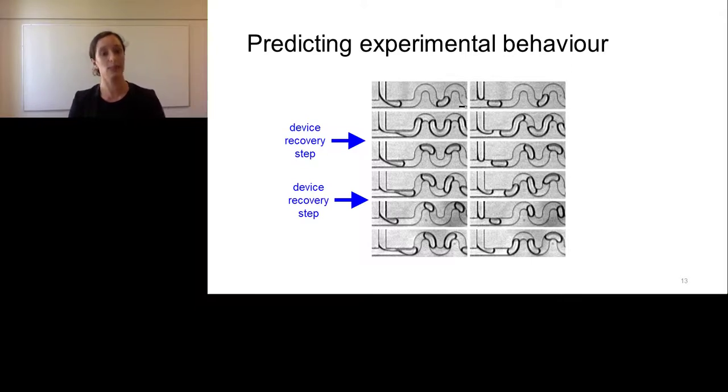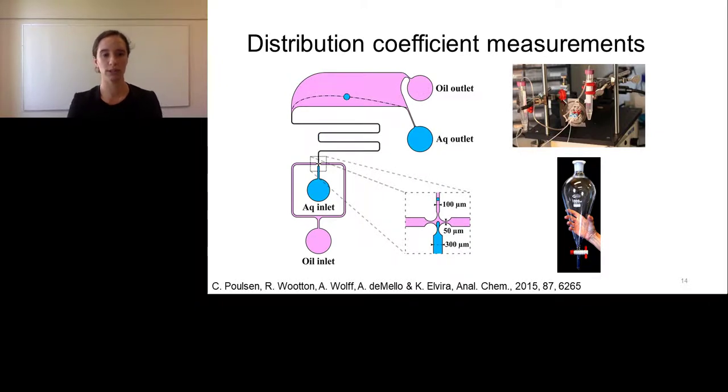That was really exciting, because I really like showing how what you would call negative results, or from a grad student perspective, extremely annoying experimental behaviour, can be used to understand the fundamentals of our system, and then we can use that knowledge to mend the system to get it working better. So from now on, I'm going to give you 2 or 3 examples of how we can use these droplets, now that we understand what they are and how they work, in drug discovery.